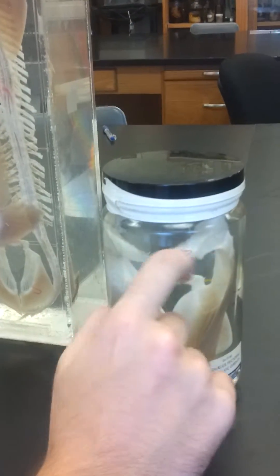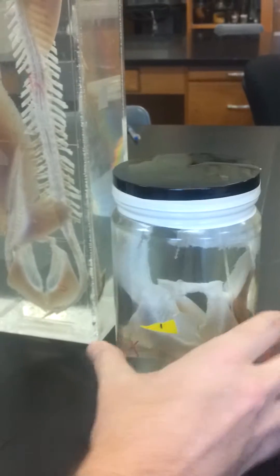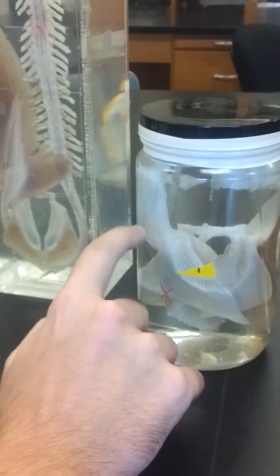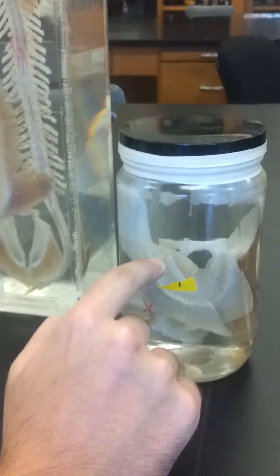This is the scapula coracoid bar, which connects the two pectoral fins and the pectoral girdle. And here is the pelvic girdle — you can see that it has an attachment because it's not directly attached to the vertebral column.